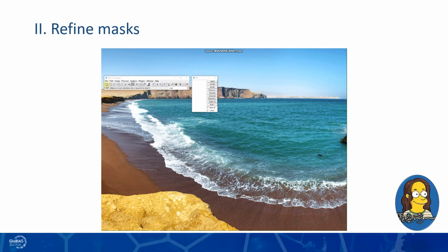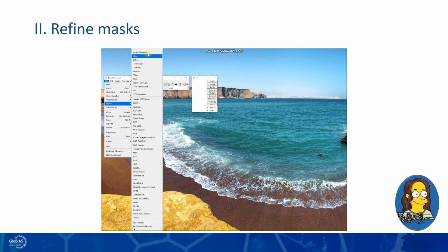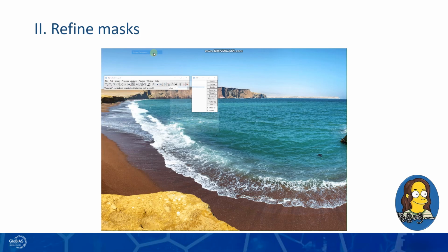Now I'm going to show how to remove non-relevant objects from images before contour extraction. The first step is loading the images. Here, we use the Import Image Sequence function in Fiji to load our images as an image stack.